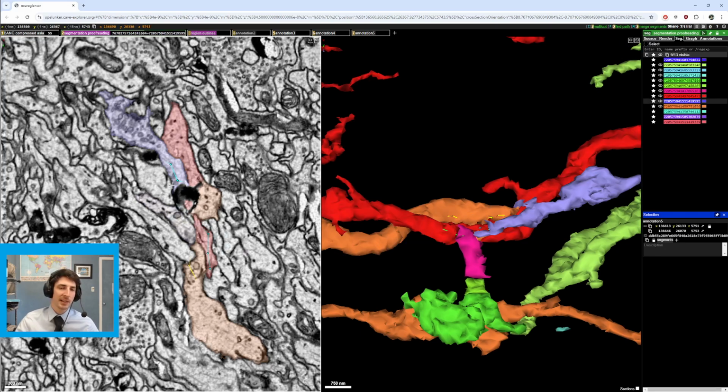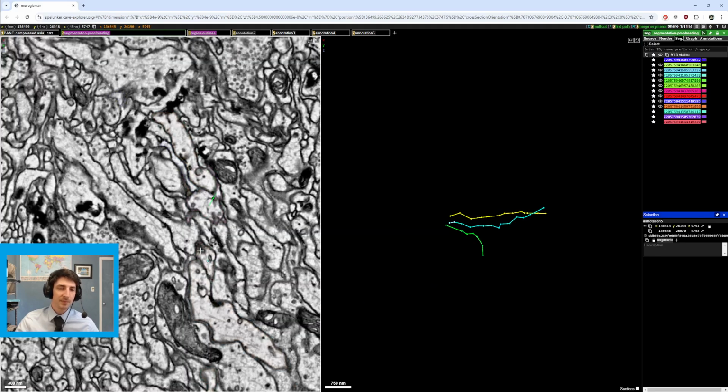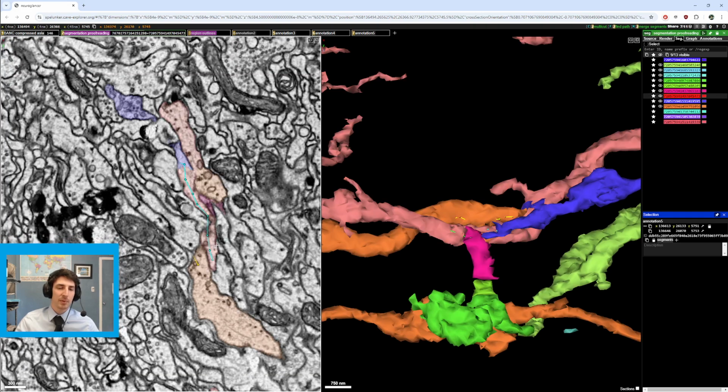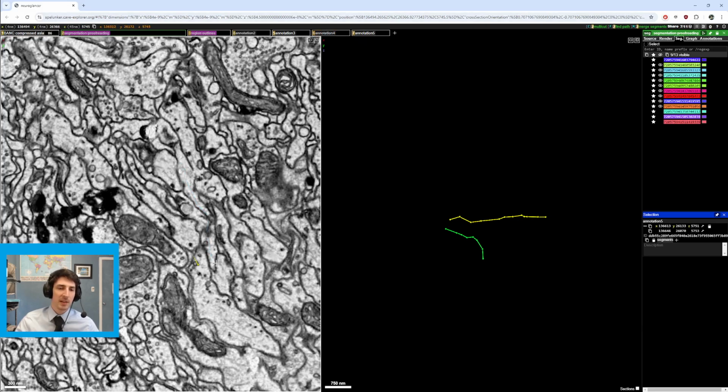But this one, it's right in the membrane swirl, so we're going to have to solve that one with the blue path. So once again, you start a little bit further away. This slice is pretty valuable because, let's turn off this point pair, you can almost see the entire path, like this connects to that.